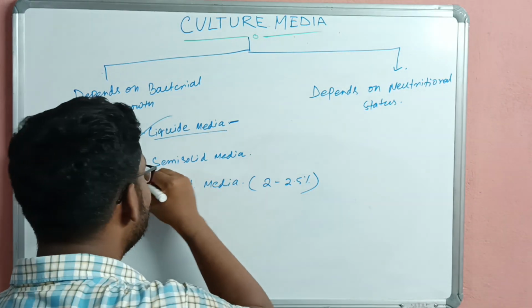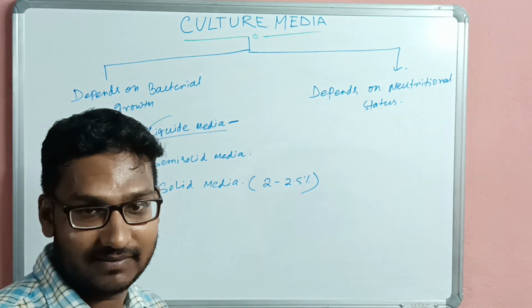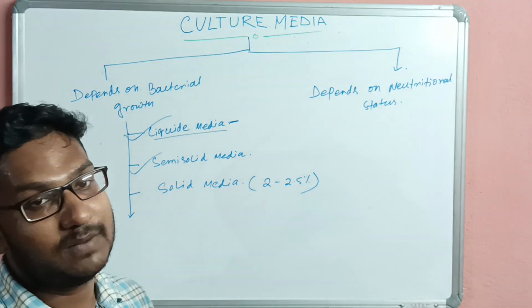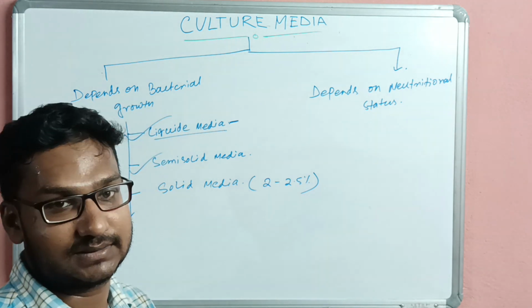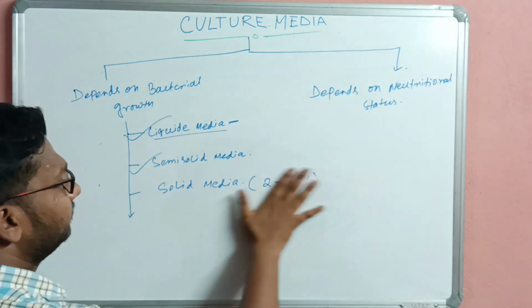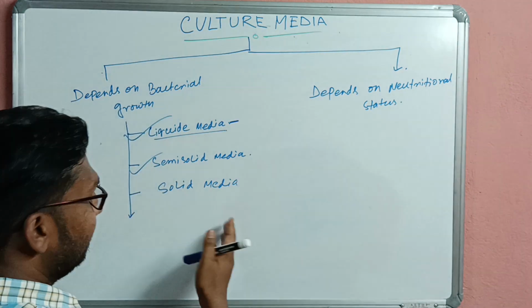In semi-solid media the colony morphology is not proper or actual. Chemical compounds must also be present in the media.